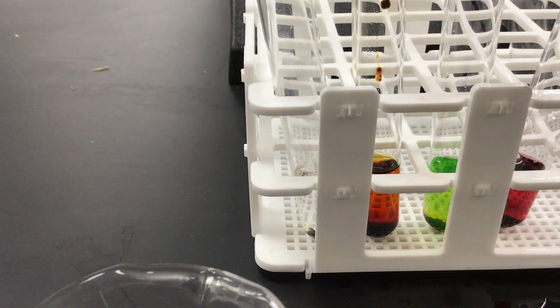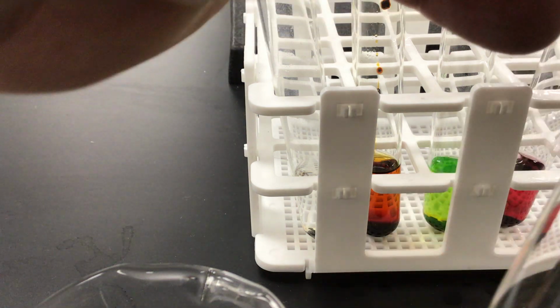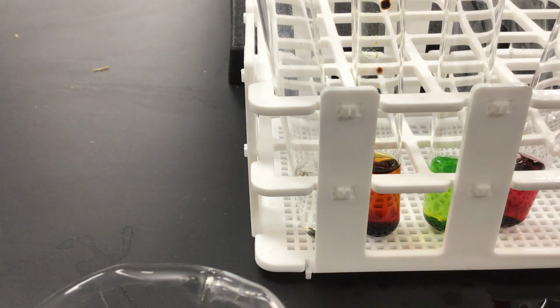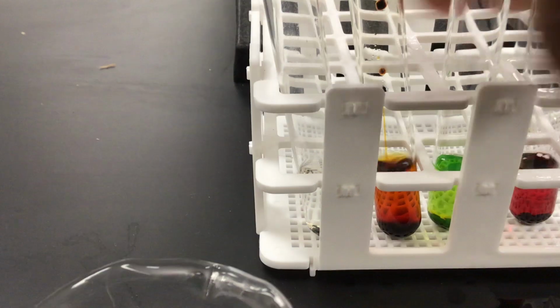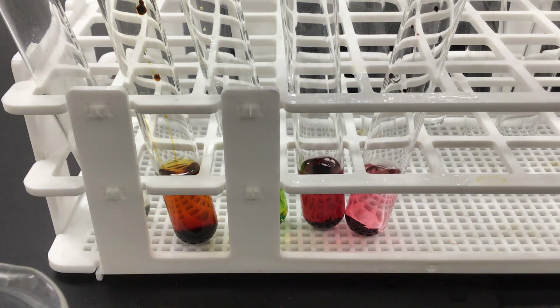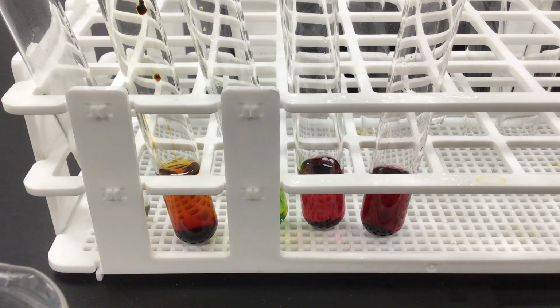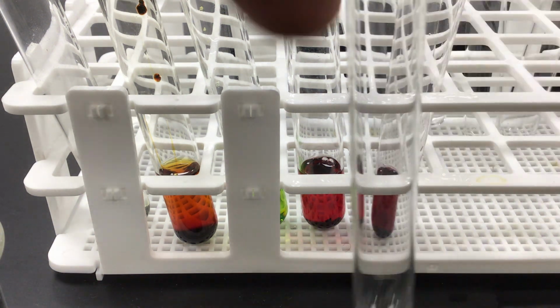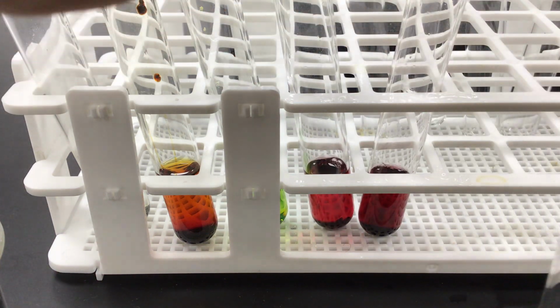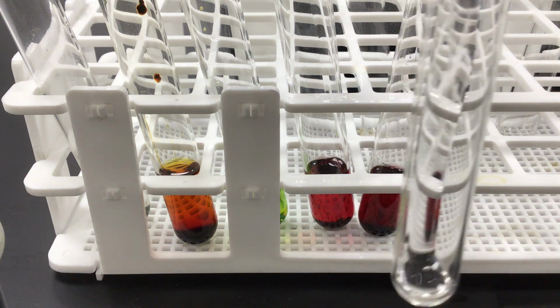Now we've got dichloromethane. And the dichloromethane and the iodine mix. And last but not least, glycerol. Glycerol is a very thick, viscous substance. Viscous means it resists the ability to pour. So it's more going to just kind of dribble down the side.